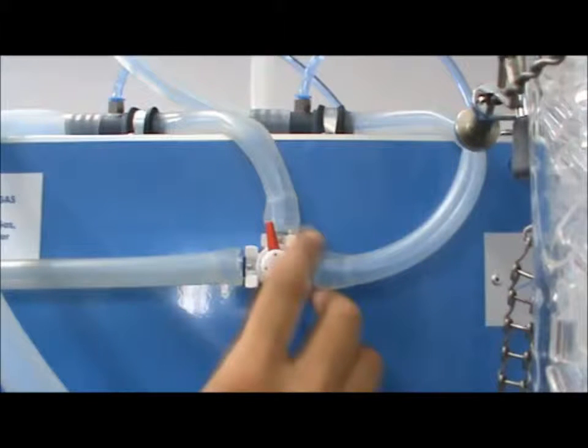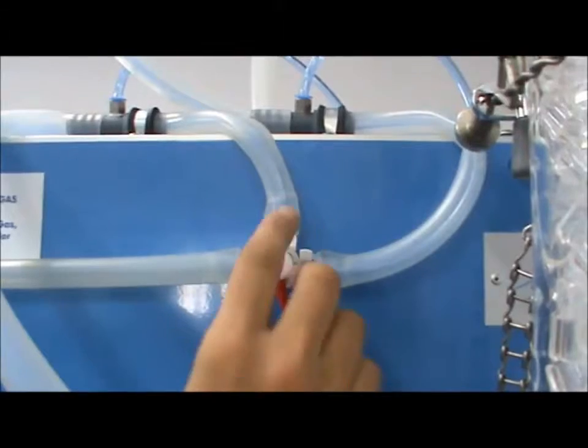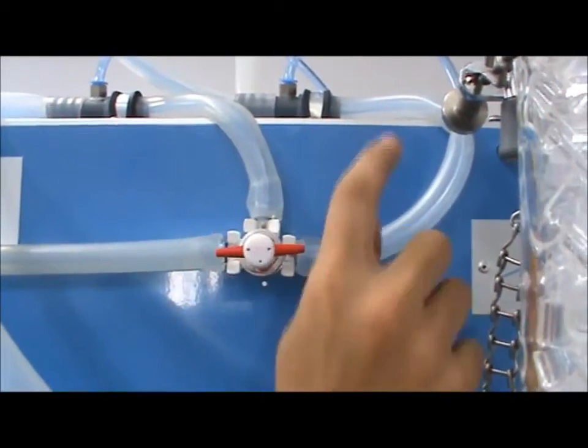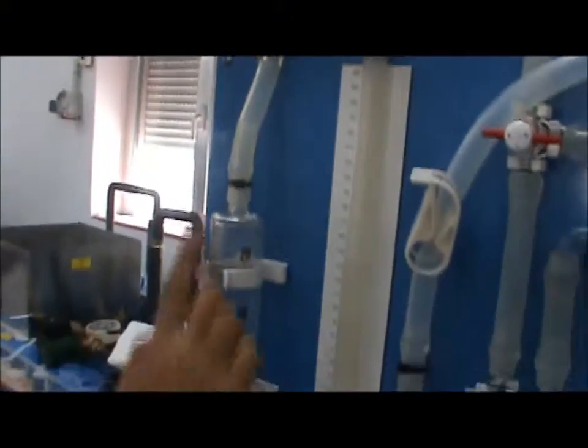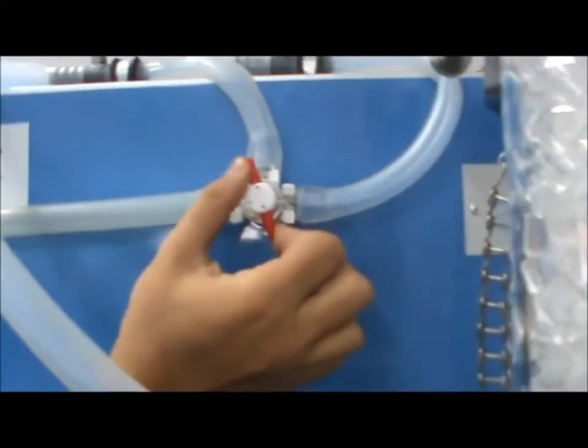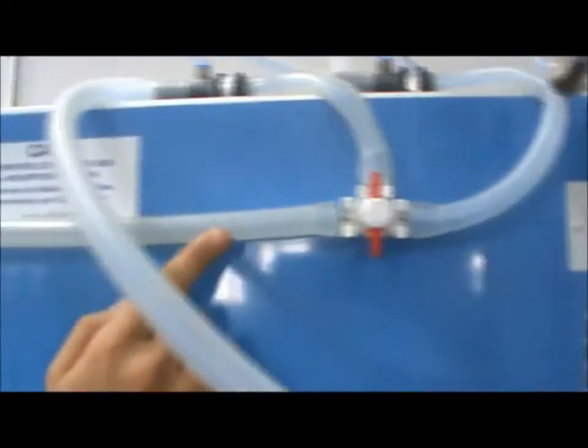Arranging valve VT1 determines where in the column samples are taken from. Positioning the valve like this, samples are taken from the upper part. In today's experiment, we will use this configuration, which takes samples from the middle of the column.